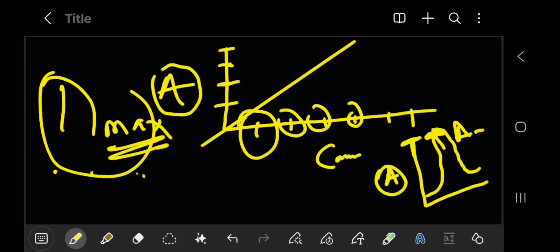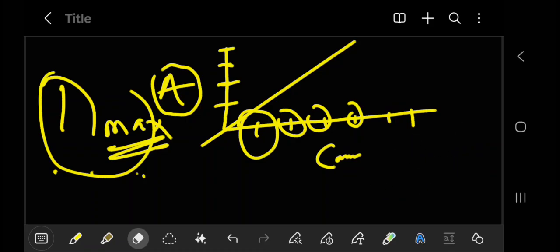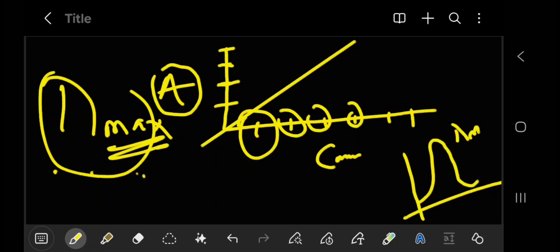That's the previous graph illustration I showed you. Wavelength was varied in the initial stage, then you got a series of absorbances. So the maximum wavelength of absorption corresponded to an absorbance.